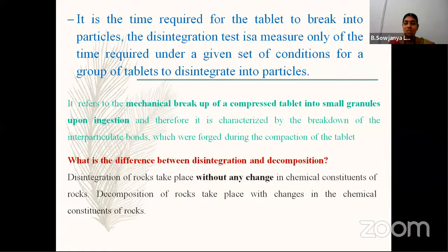What is the difference between disintegration and decomposition? Is there any difference observed between disintegration and decomposition? Disintegration means the tablet completely splits into particles, in the case of granules, without any change in their chemical constituents.